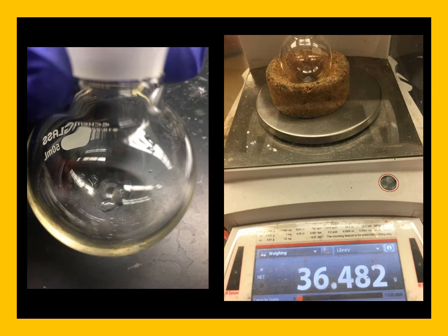Now you can see I only got a little bit of this colorless oil that smells as if what you smell in soaps and things that are designed to smell like hyacinth. You can see that I've now weighed it, and now my round bottom flask plus this oil is 36.482 grams. And so if I subtract the mass of the round bottom flask, I can obtain the mass of my product. And we're also going to post the GC information, but I filled a GC vial with a little bit of this sample, and we'll be looking at the GC.